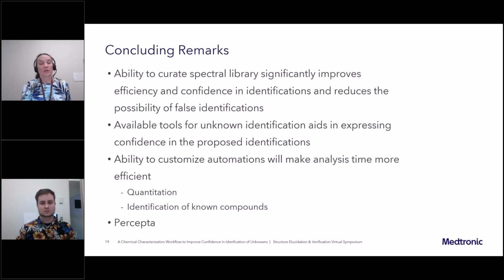We are also looking into expanding for Percepta, which is a toxicologist tool for performing their risk assessment on all those compounds that we have identified. The beauty of that is they can pull our data without modifying it into their software, and then they can do their risk assessment within the Percepta software, but using that Oracle data and actually importing it into Percepta.